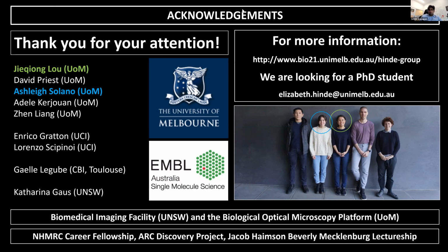All right, Liz, I was also curious about the homo-FRET experiment that you described. Do you just do steady state anisotropy with different polarizers, or do you also do lifetime anisotropy there? No, yeah, we did steady state. So we just had a polarization cube in the detection. And it was interesting comparing the brightness with the homo-FRET, because the brightness is only good at detecting a mobile population, the homo-FRET sometimes gives you more information on species that aren't captured by the brightness analysis.